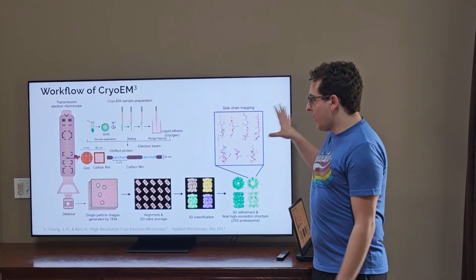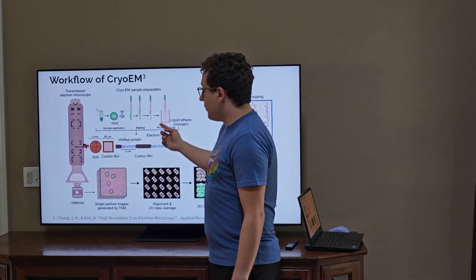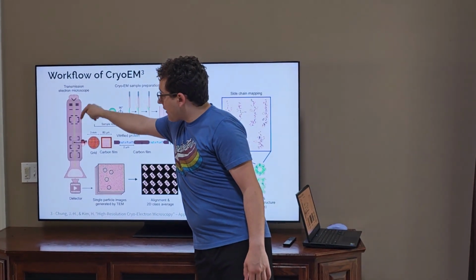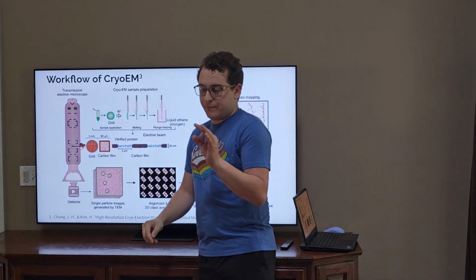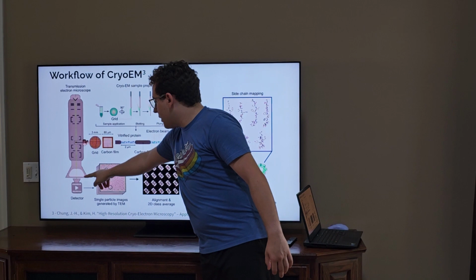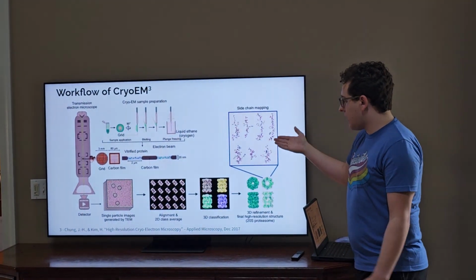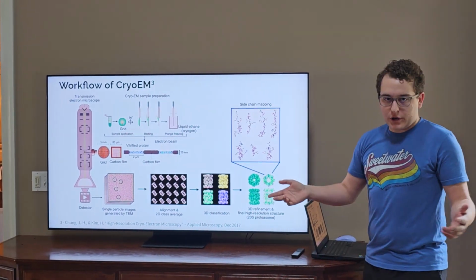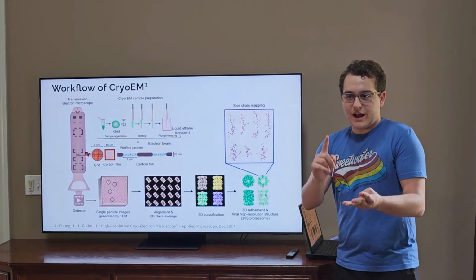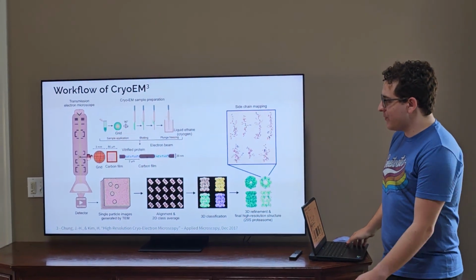So a very quick overview of what all this is. You prepare a sample, we take that sample, we put it on a grid in the electron microscope. Electrons are passed through, so really small, high energy balls are bounced off the sample, then they produce a shadow down here. The shadow is detected, and then we interpret the data from there. And that's how we get our really cool structures. Pretty simple. Prepare a grid, scan the grid, then look at the grid with the camera, and then process your data from the camera. It's not that bad once you break it down into smaller steps.